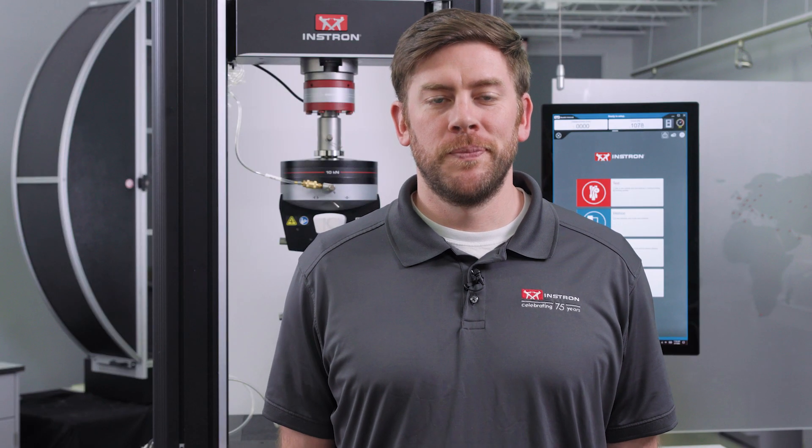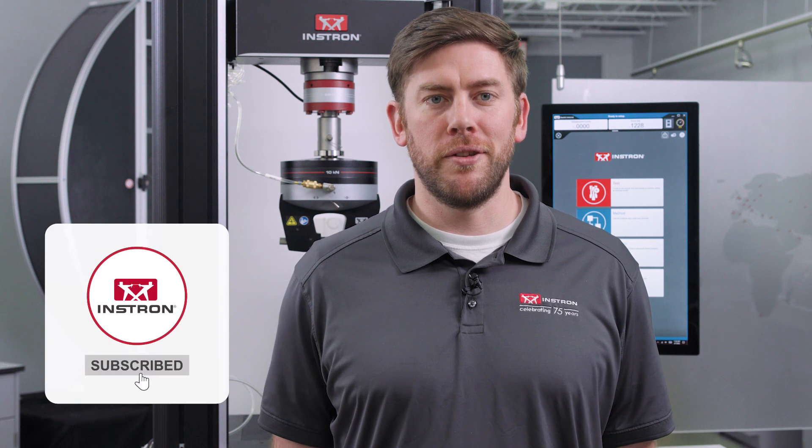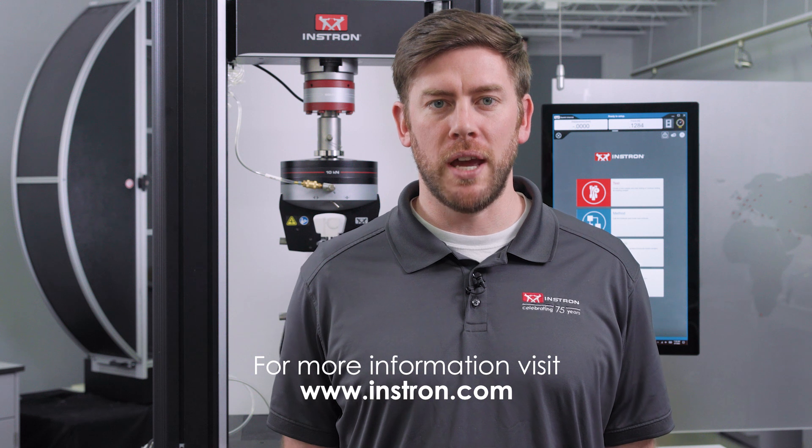And that's a quick look at Specimen Protect. For more information about 6800 series features, please check out some of our other YouTube videos, visit instron.com, or reach out with any questions.